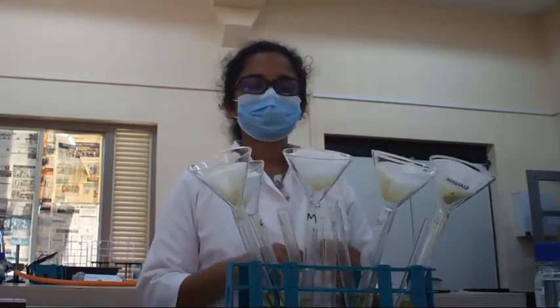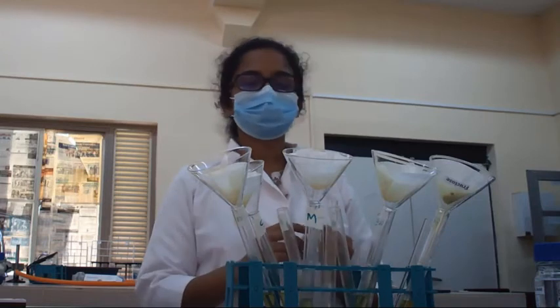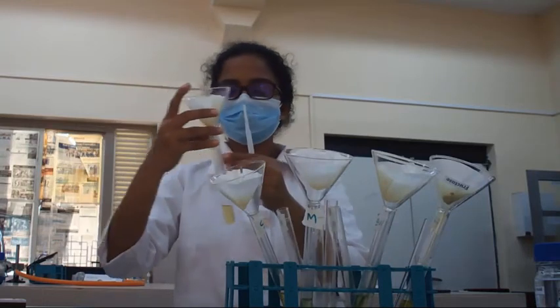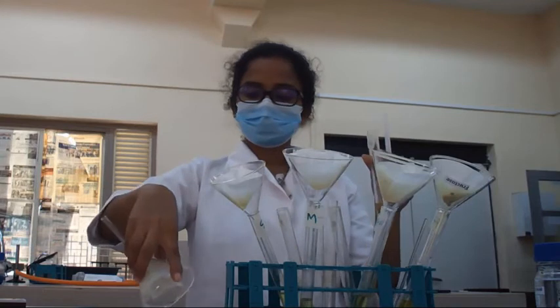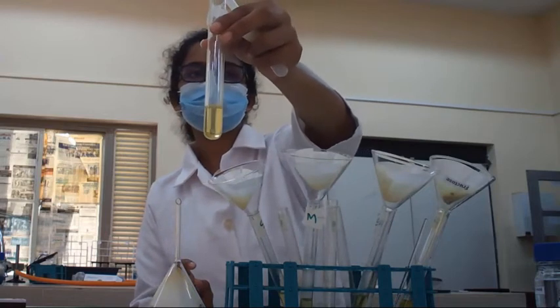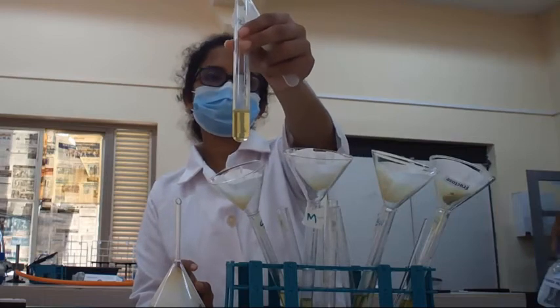Now you can see we have kept the samples for filtration, and after filtration, we are going to take this filtrate, and we are going to add drops of glacial acetic acid into these samples.